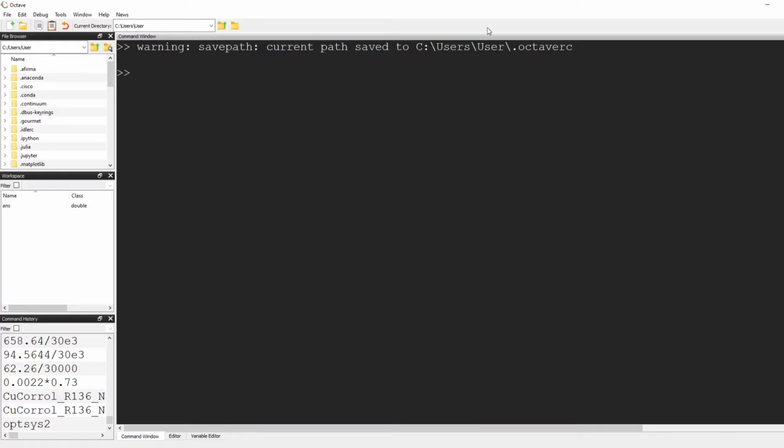In order to start using EasySpin, you need to compile it. For that, you type easyspin_compile, and there are a few files which will be compiled. That means they are written in C++ and will be compiled inside Matlab or Octave to executables. This has to be done because these functions are very performance critical, so they need to be fast.